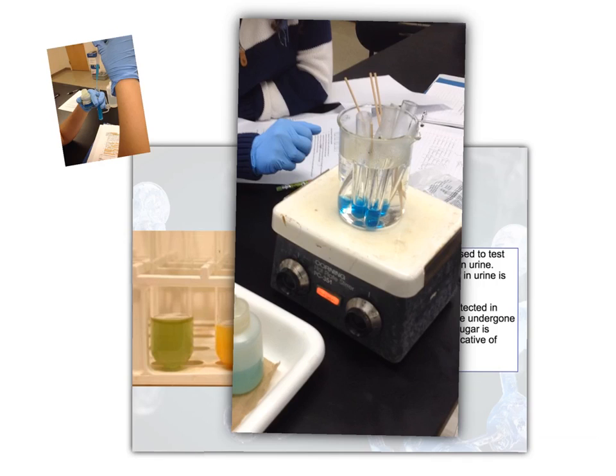Now obviously there are certain things that you would change. They definitely do not have enough sample in their actual test tubes, so you would definitely need more sample. That does not look like enough to me. You also would want to make sure that you have a rolling boil.